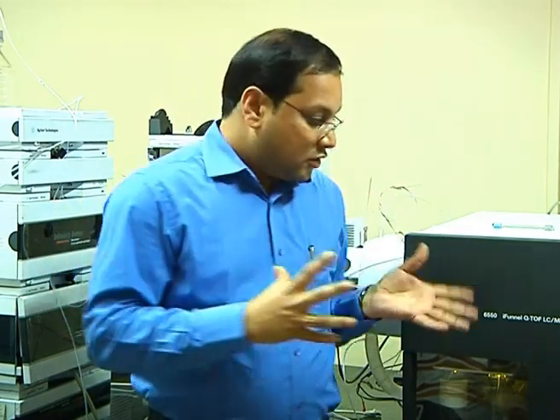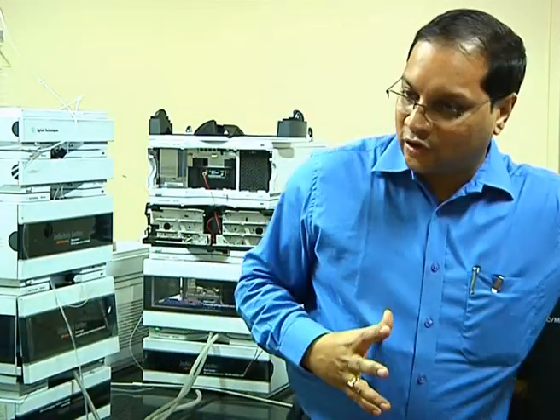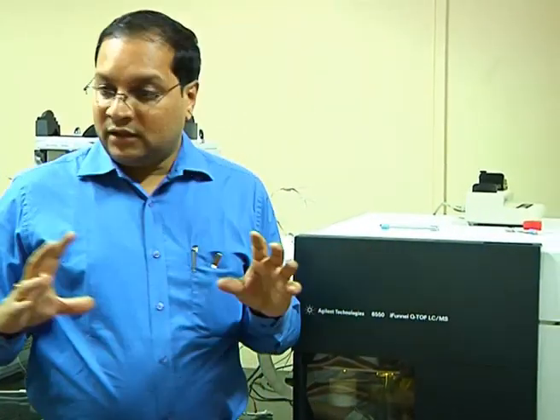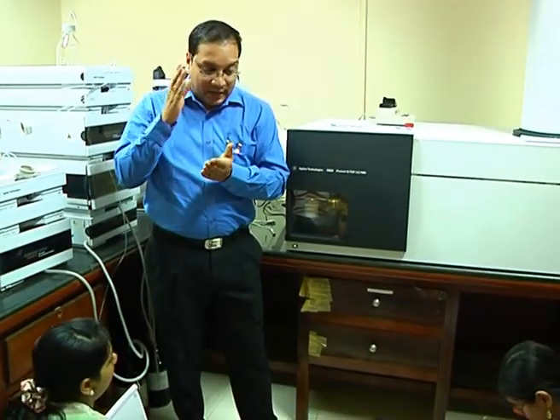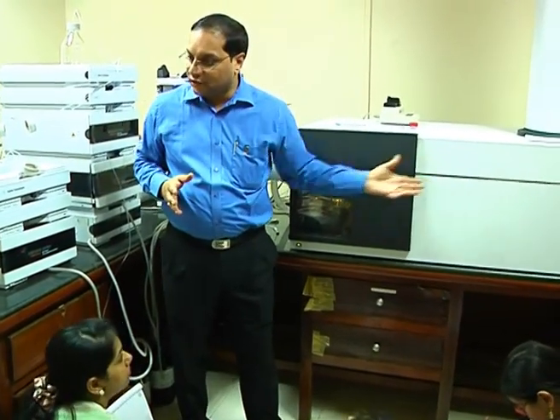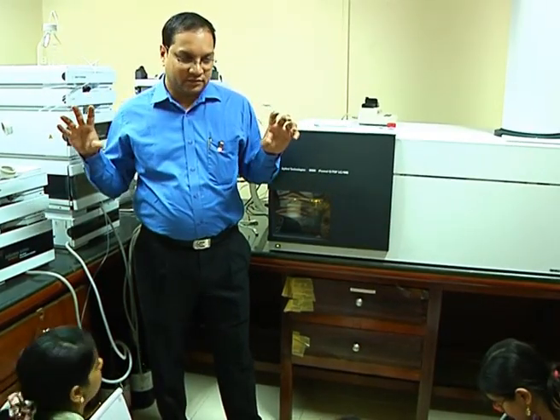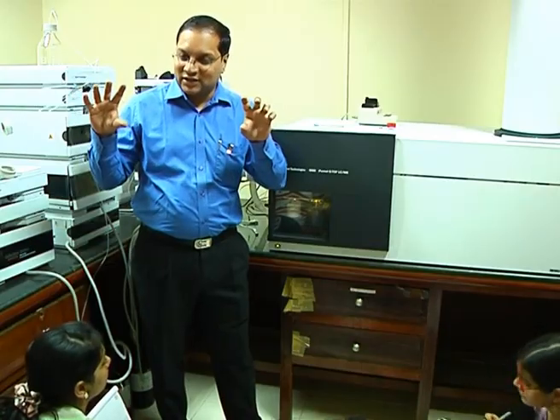You have heard the name triple quad: quadrupole, collision cell, another quadrupole. Instead of time of flight, if you put another quadrupole, it becomes a triple quadrupole. When you have two mass analyzers with a collision cell in between, you call it tandem MS, because they are talking to each other.